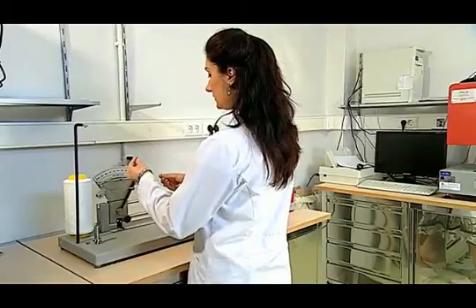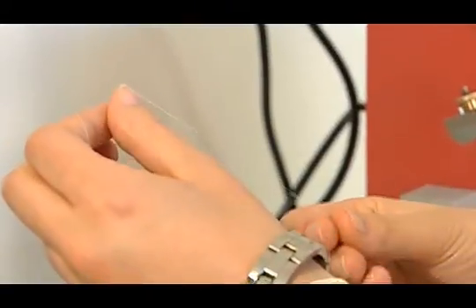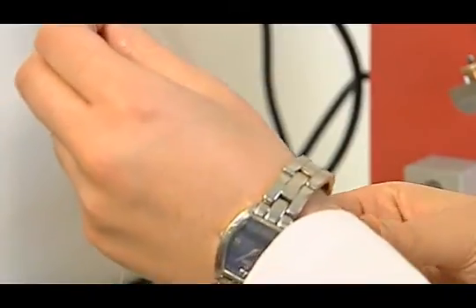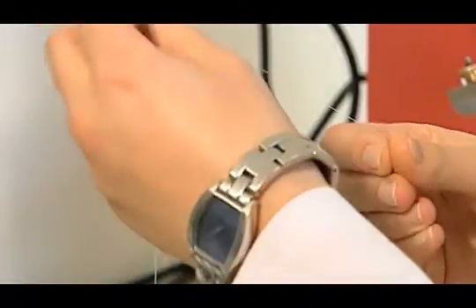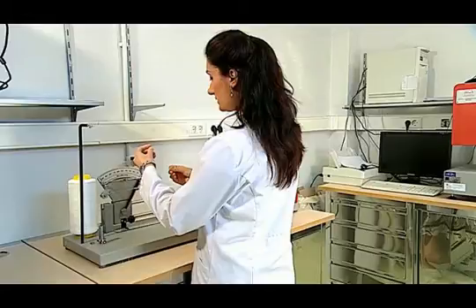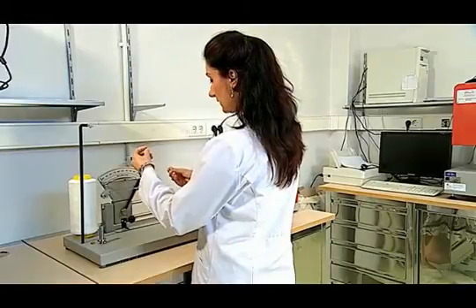Tek katlı ipliğimizin öncelikle büküm yönünü tayin ediyoruz. Bunun için yaklaşık olarak 10 cm iplikten sarkıtarak büküm yönü tayini yapılır ve bükümün sağ yönlümü, sol yönlümü olduğuna karar verilir.